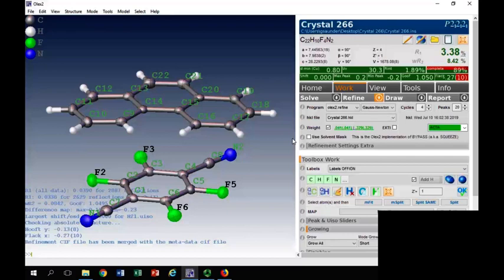Okay, it's the ones that are a bit harder where you have to spot things. Or the student told you the wrong formula, or it's something else entirely, you know, rather than being a gallium compound, it's something like a platinum compound. There's a bit of working out, or things are on mirror planes, so it's hard. But the ones I've given you should be relatively easy.